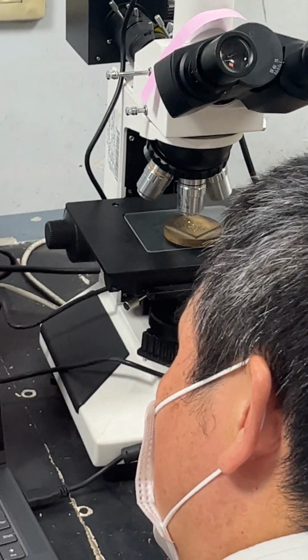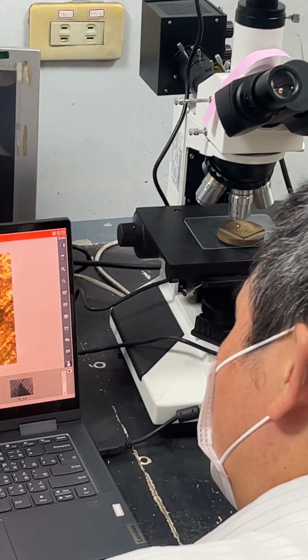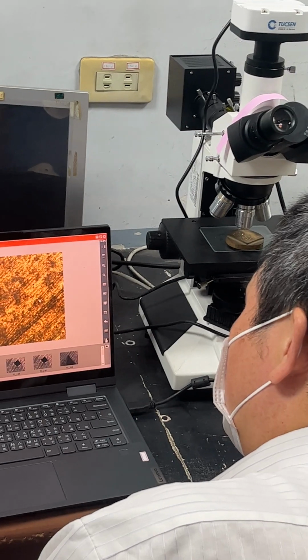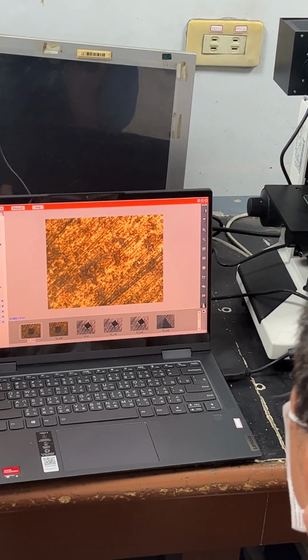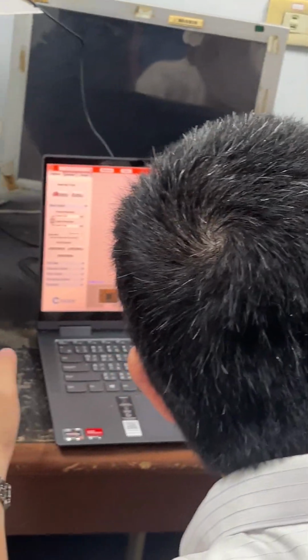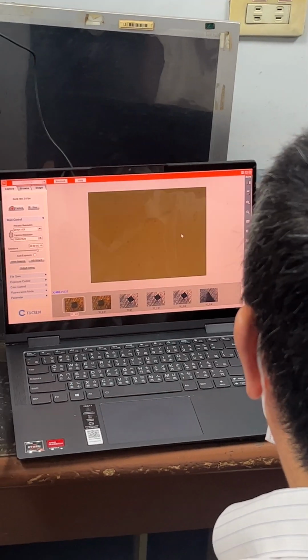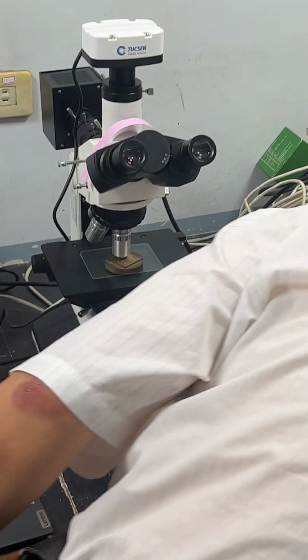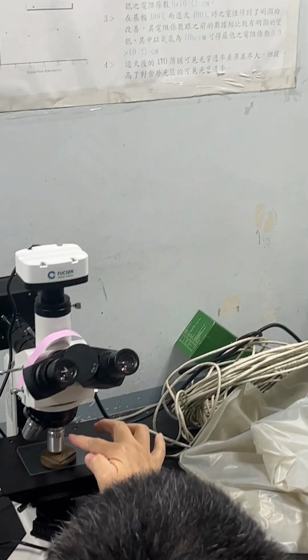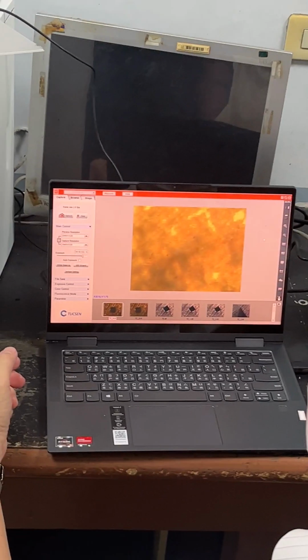So to fine tune that, to find the optimal image, the clearest. Okay, this is 20 times 10, 200. And the highest for this one so far, this is 50. I think yes. Over here, it's written here, 50. 50 times 10, which is 500.